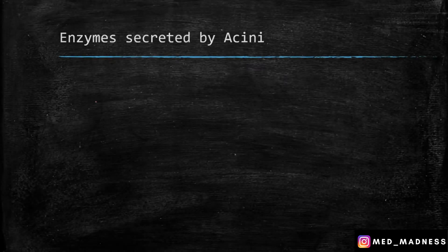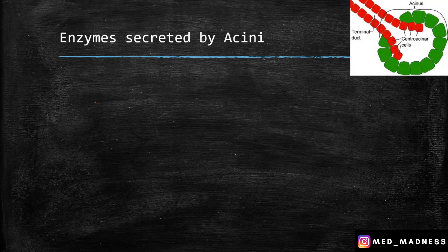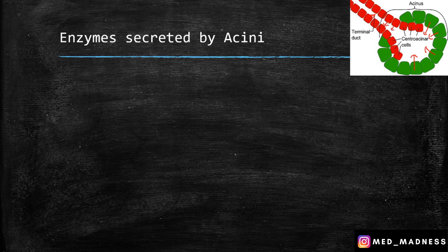What are all the enzymes secreted by the acini? Remember, this is the acinus — a single acinus. These are all the cells that are going to secrete digestive enzymes. And remember, the ductal cells here are also very important for secretion of bicarbonate.